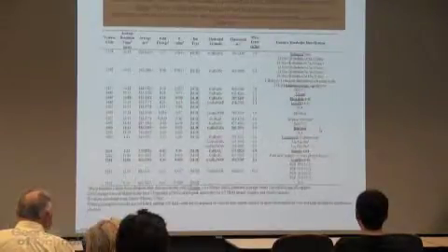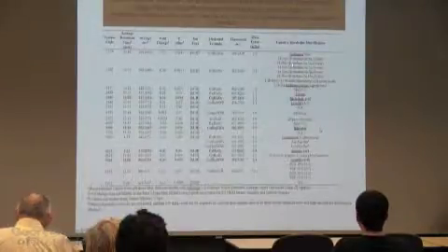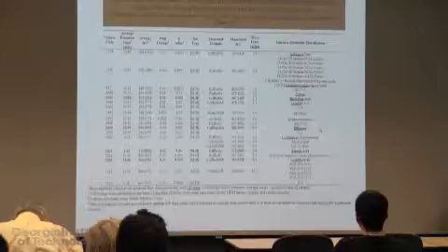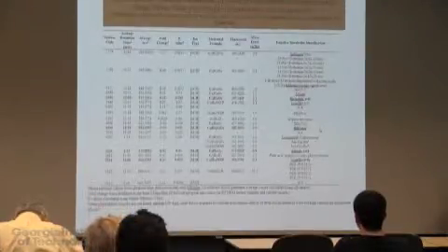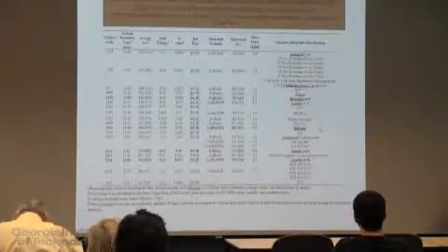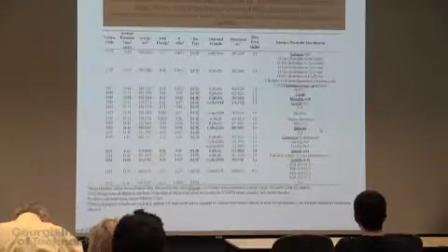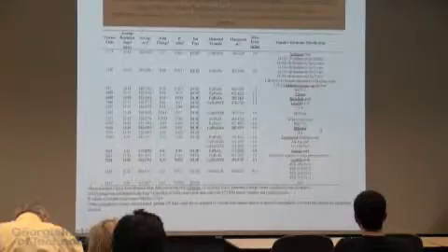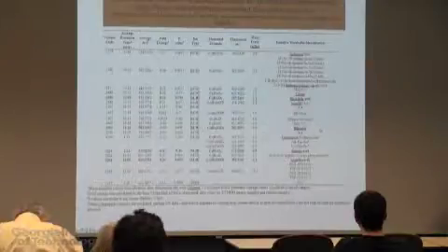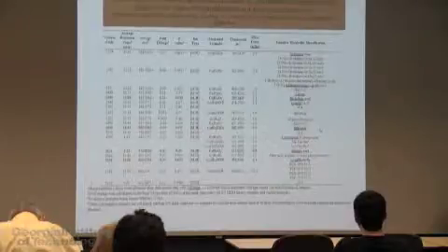So by no means do I want you to remember everything in this table. What's really important is here in this column, and these are identities of these molecules, metabolites. They have different degrees of confidence. Some are probably wrong, some are probably right, because we cannot do it on all of them. Some of them are very low abundance, and on those you really cannot do reliable fragmentation. Okay, and some of them we have fragmentation and we have masses, but we cannot do chromatography well because there are no standards.